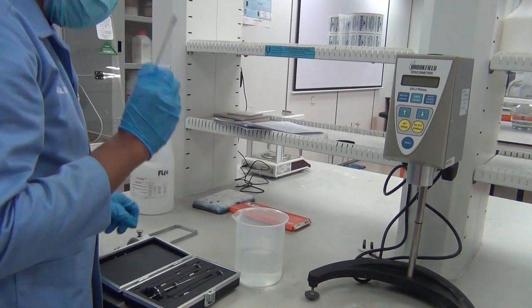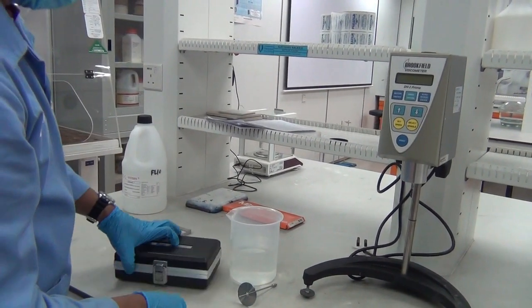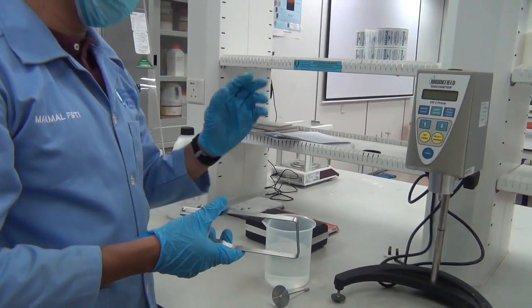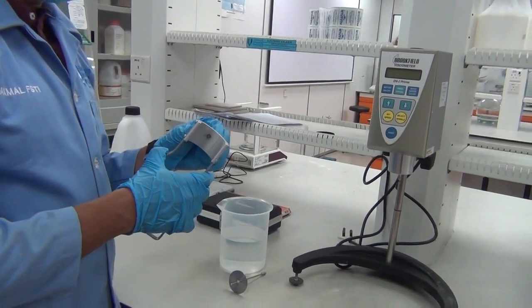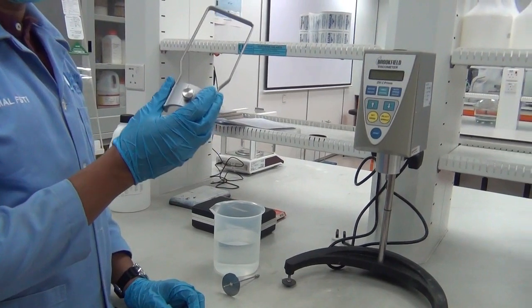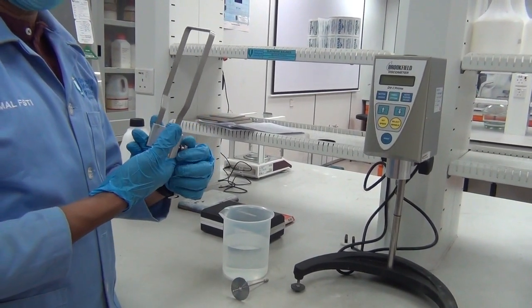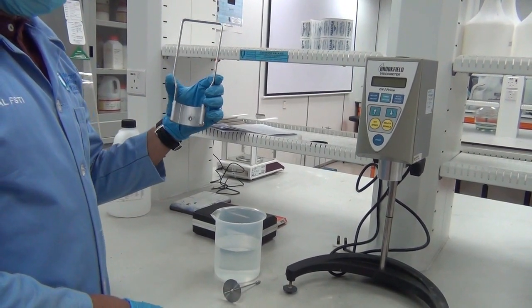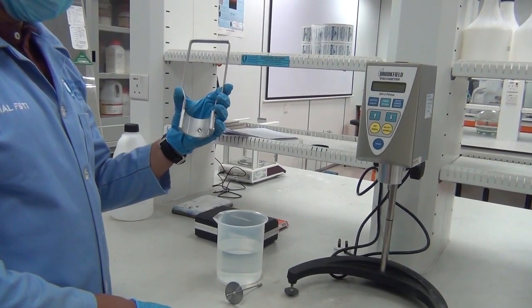We know our spindle, just put it here, and then we need to check what else is needed to operate this viscometer. We might use this, which we call a guard leg. Why do we use the guard leg? To avoid problems during the measurement, such as secondary flow.